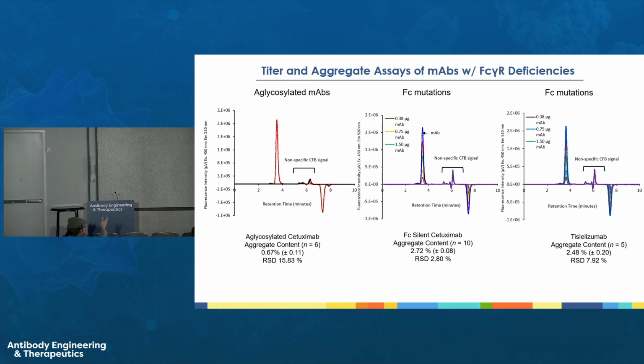No, because this is only binding to the Fc portion that is unaffected. If you want to measure Fc receptor binding change, you actually have to use Fc receptor as a ligand to measure that change, and use this molecular recognition agent to get it to a titer. So you can get a relative proportion. I can say 80% of my product does not bind Fc. Okay, got it. Thank you. Okay. Perfect.